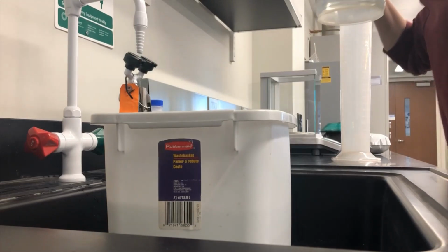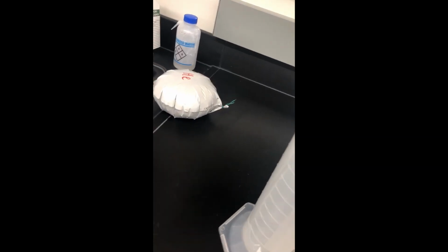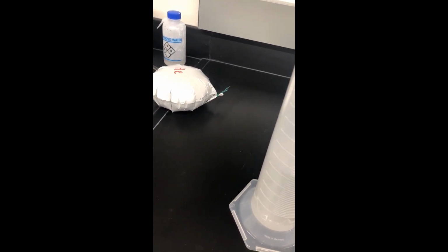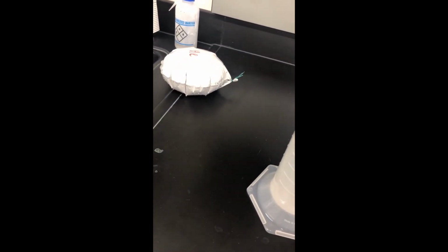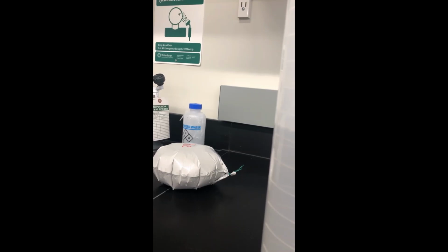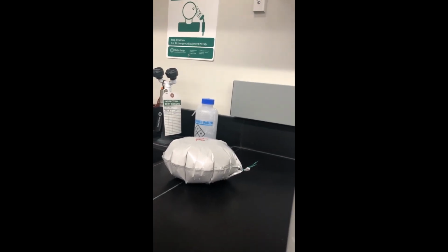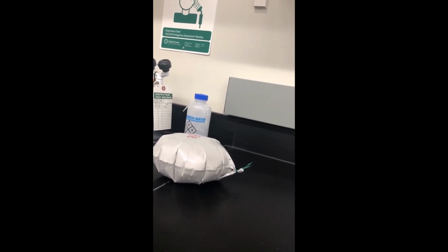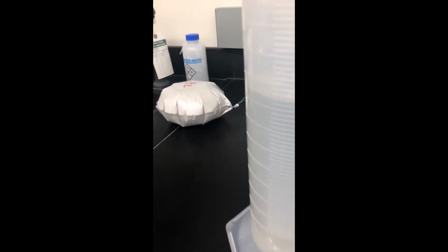Okay, so now I will pour it into this graduated cylinder to try to get a more accurate volume. And it appears that the volume is 940 milliliters. Yeah, 940 milliliters.